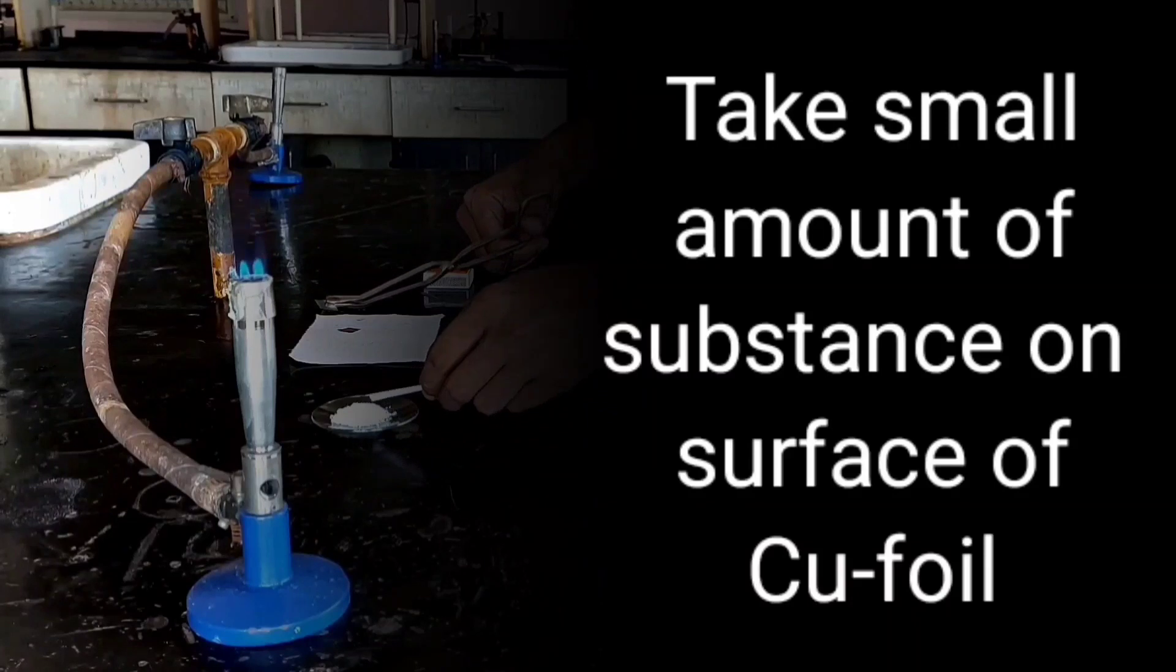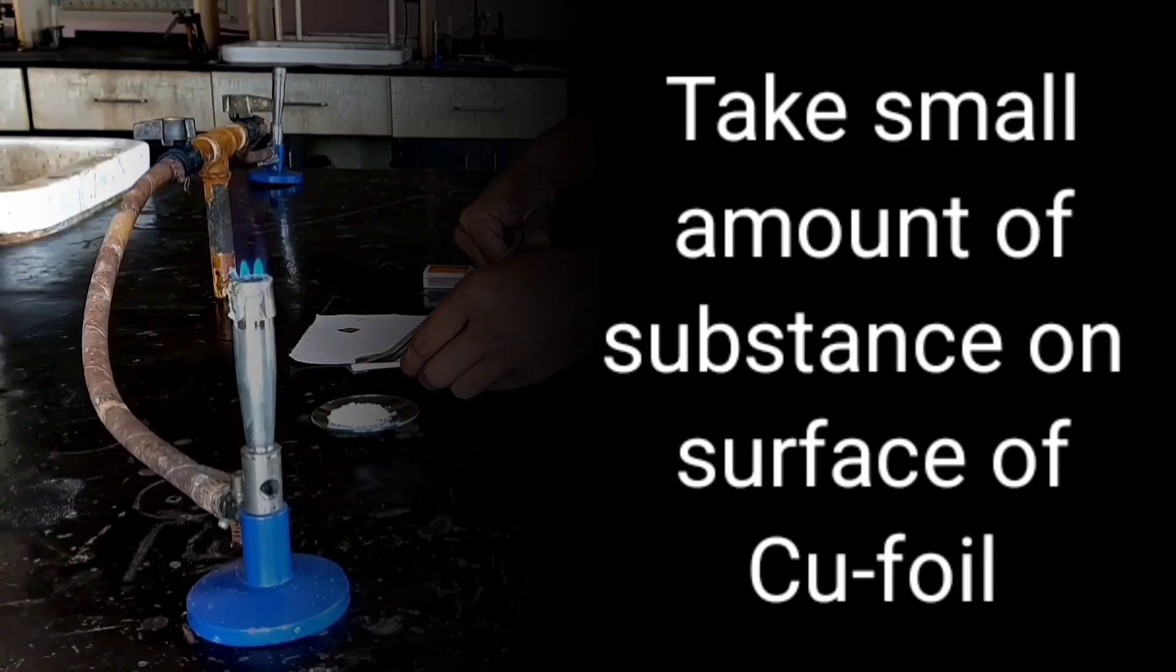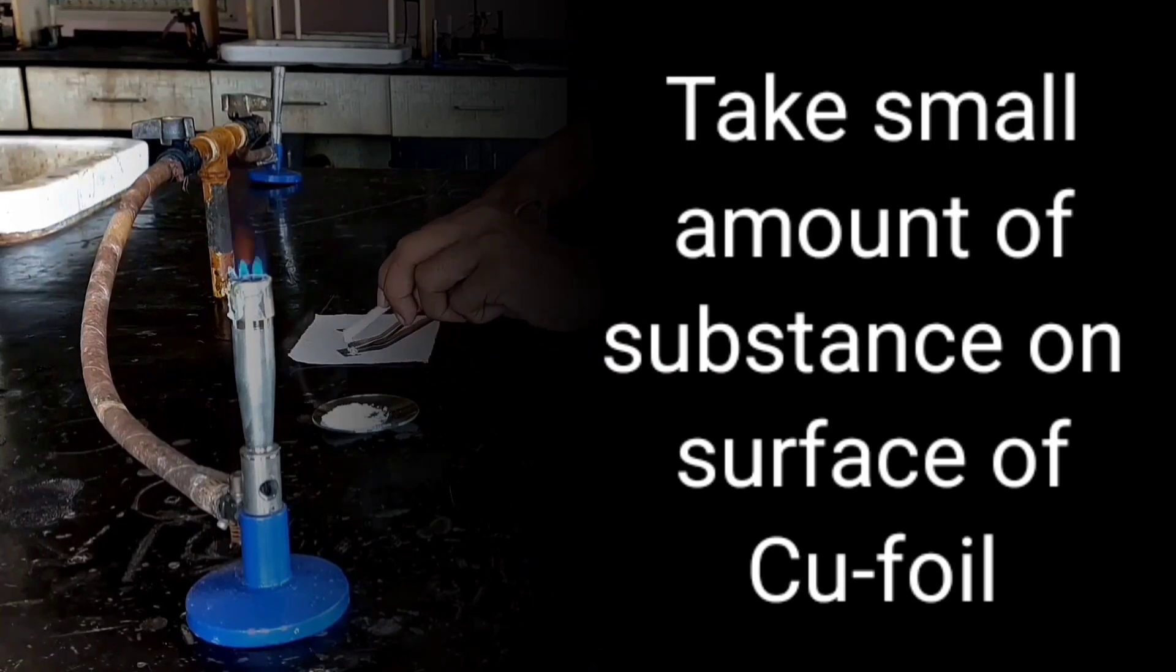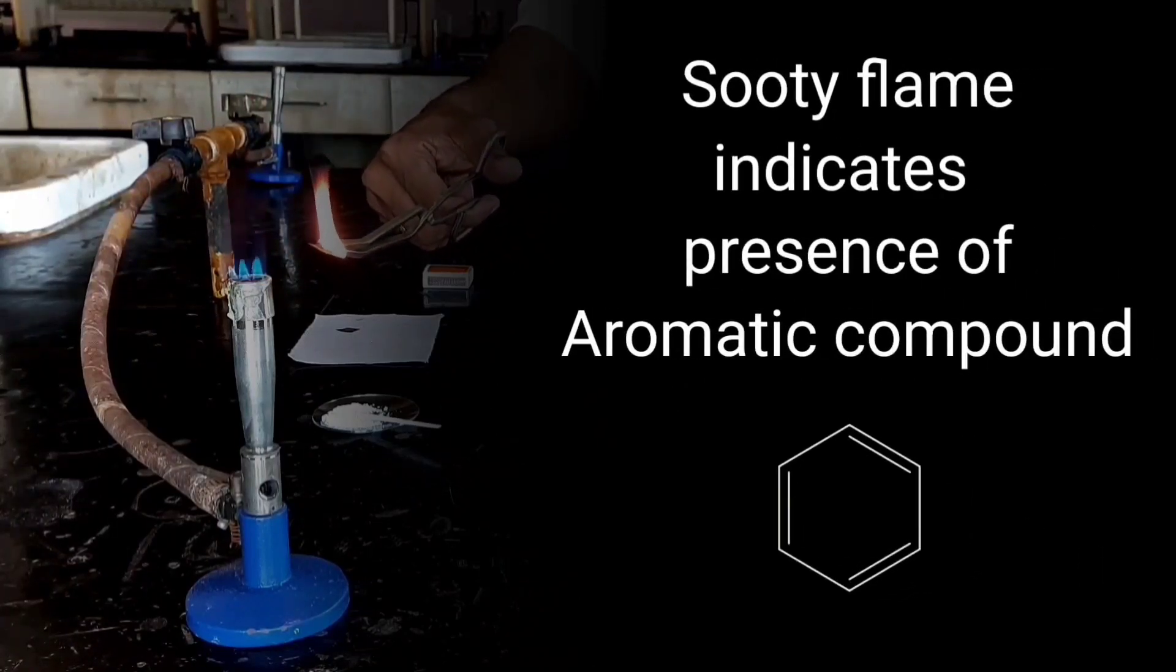Take small amount of substance on the surface of copper foil and heat it on oxidizing flame. Sooty flame indicates presence of aromatic compound.